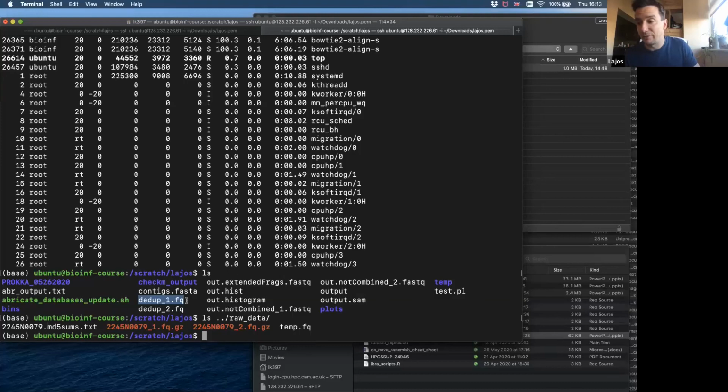So you will have a chance to build better contigs because you have longer reads. But it's perfectly okay not to merge any of these reads before, because it will anyway show up in your alignment file that they are overlapping.